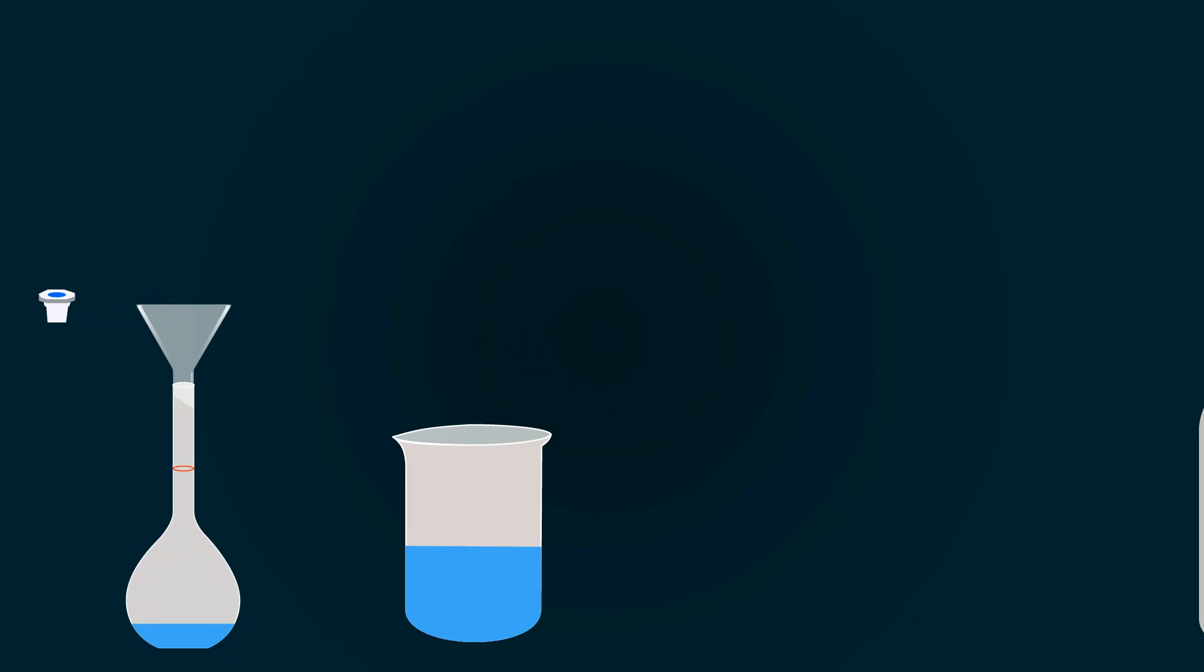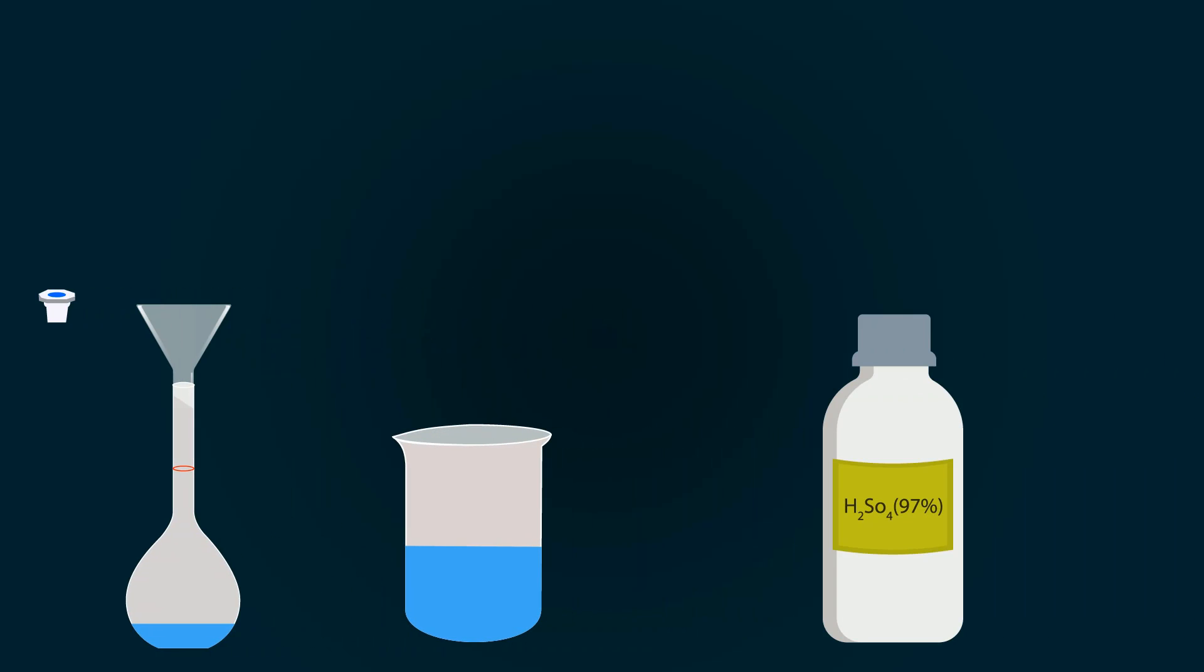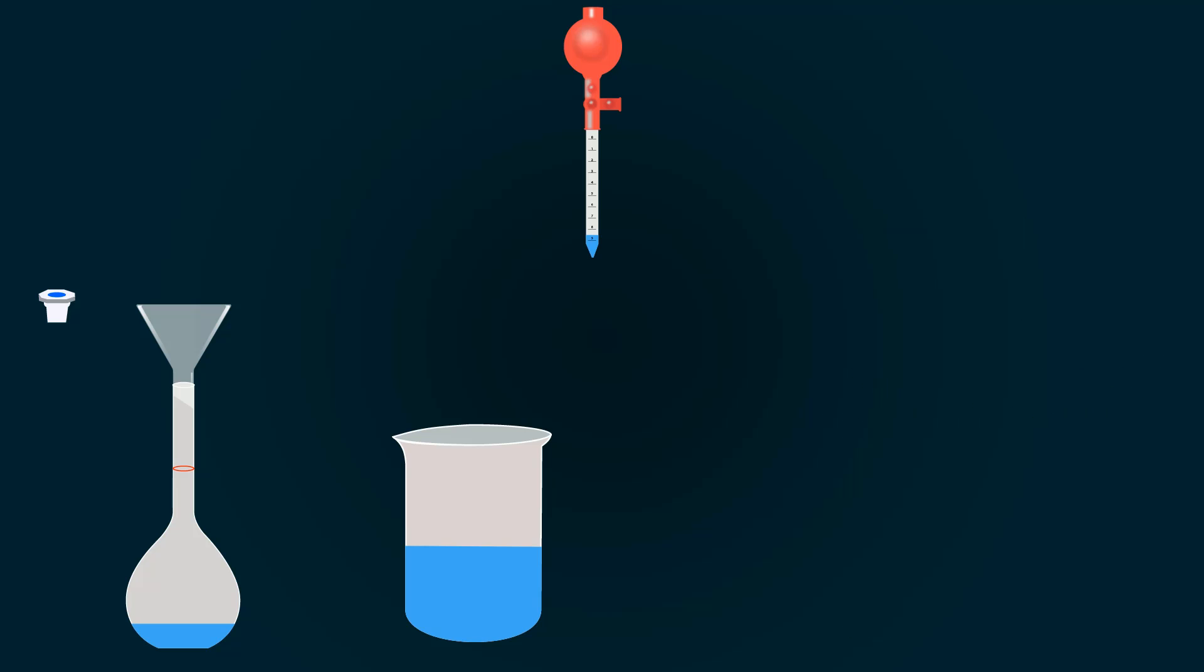Now take sulfuric acid and pipette out the required volume of 1.4 milliliter. Put this 1.4ml into the measuring flask.